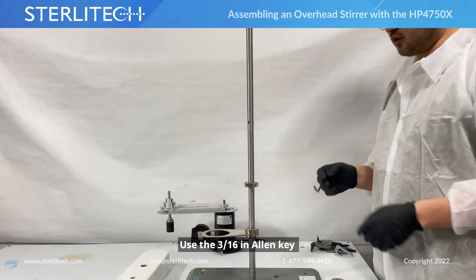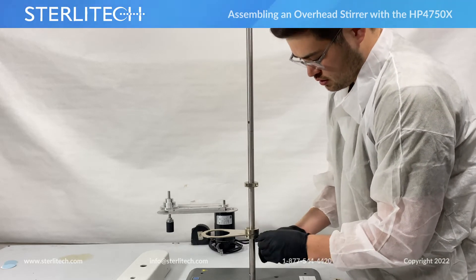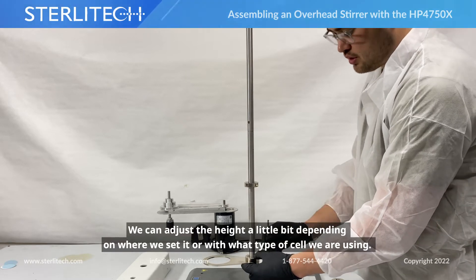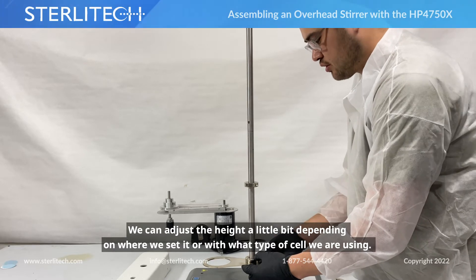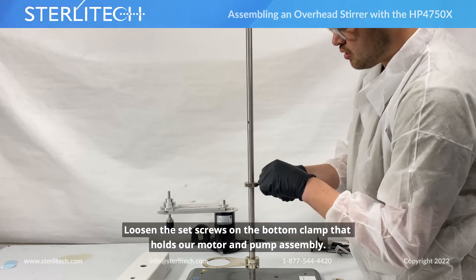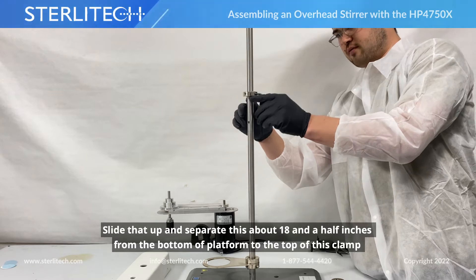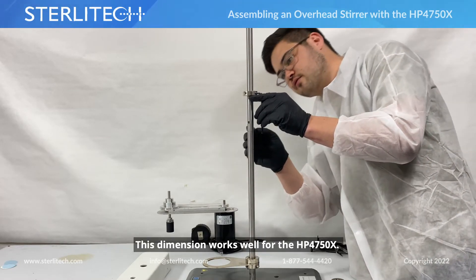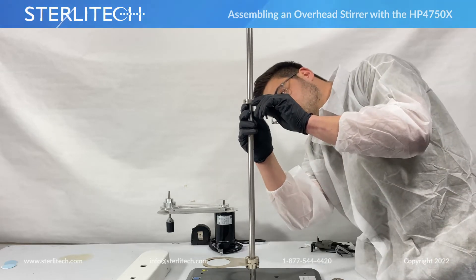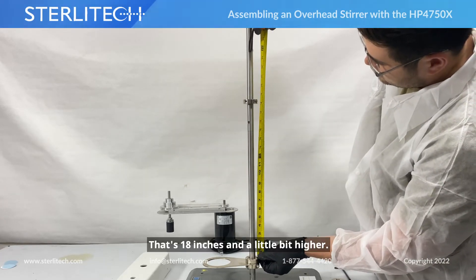Back to our 3/16" allen key — loosen the clamp holding our cell holder at the bottom. There are going to be two set screws on the back side. We'll loosen both of those up about two to three inches above the base, and we can always adjust this depending on what type of cell we are using. Now loosen the set screws on the bottom clamp that holds our motor and pulley assembly, slide that up. I like to separate this about 18.5 inches from the bottom to the top of this clamp — that's what works well for our HP4750X.